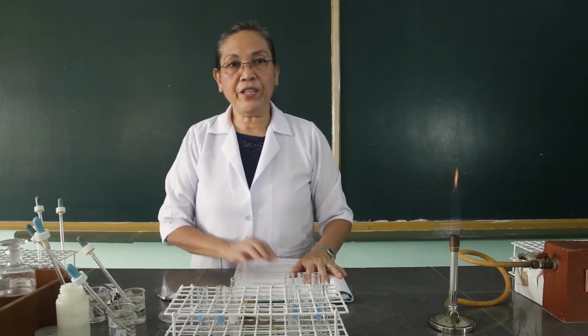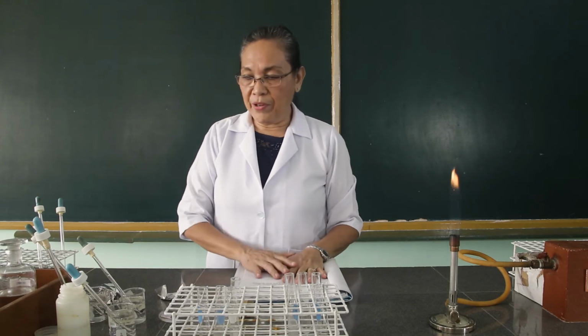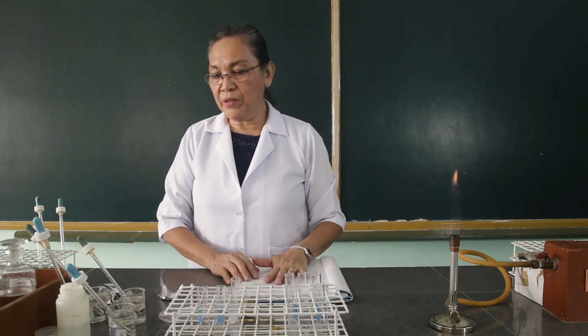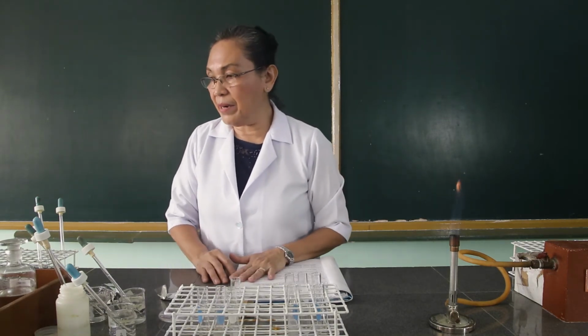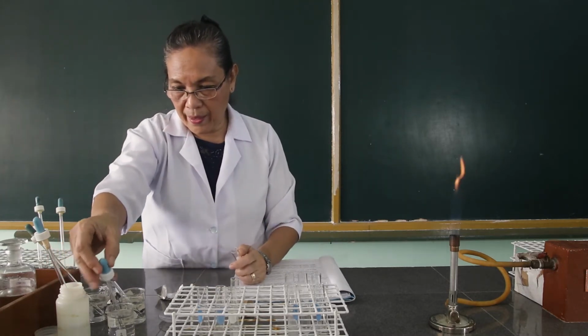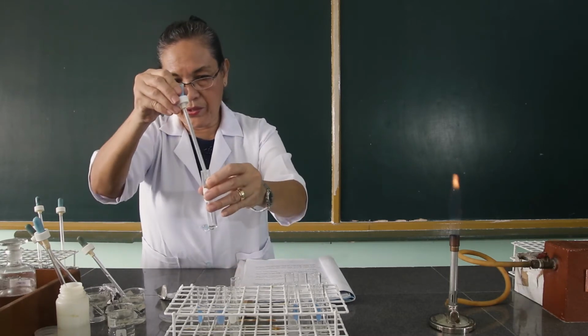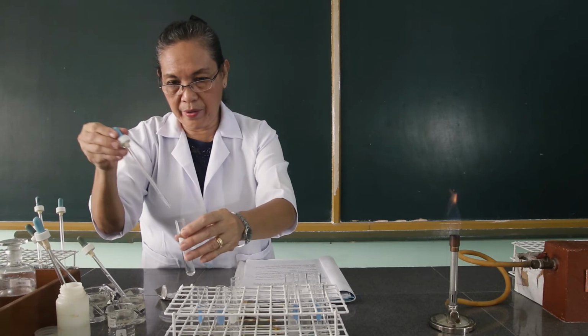Then this time we are going to add the saturated ammonium chloride with ammonium hydroxide, the strontium chloride, and the ammonium carbonate. Saturated a little bit more.